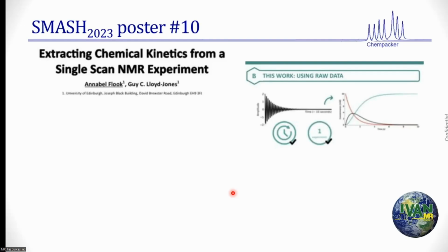I have only access to Bayesian, which is Larry's tool that exists in cyberspace, and I download it and use it. If somebody else writes some other tool that works better, sure. But the concept of going from time domain to tabular domain to frequency domain makes a lot more sense to me, because it has a lot more potential opportunities that we never thought of. Imagine, in this particular example, a reaction as fast as during your acquisition. Equilibrium, 2 protons exchanging at a fast rate. There is an opportunity here to study.